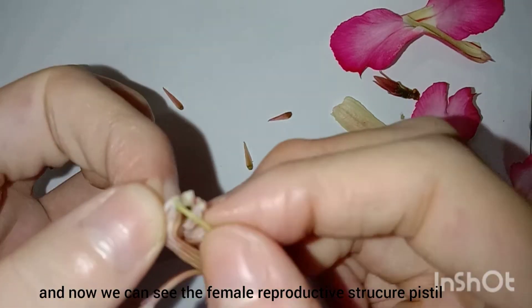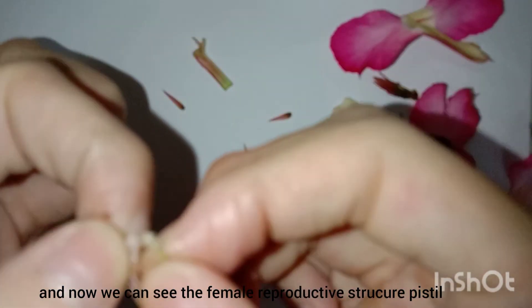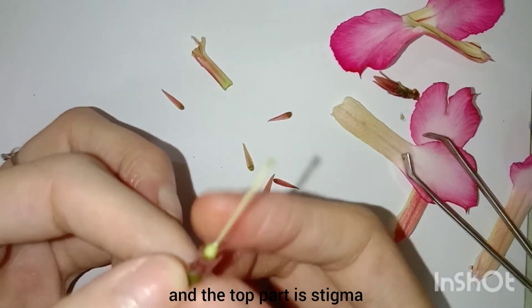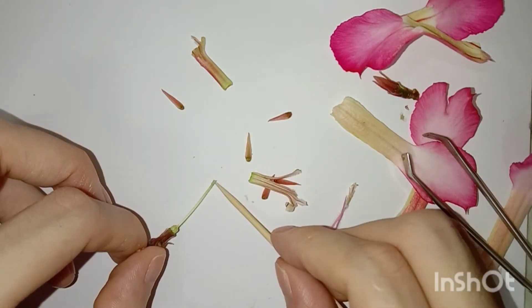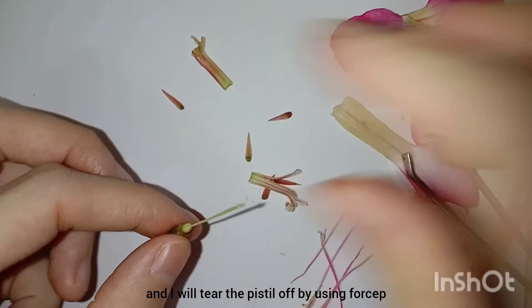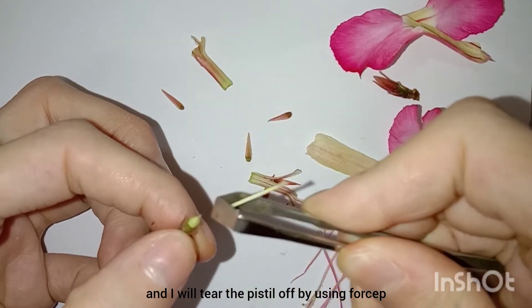And now we can see the female reproductive structure, pistil. And the top part is the stigma, and this is the stigma, which is sticky.